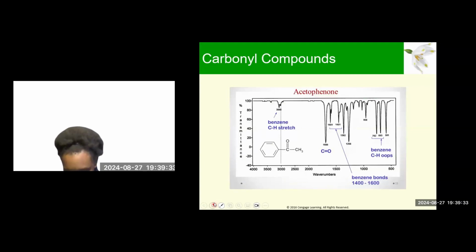So here, again, you see this carbonyl peak at around 1700. Now, because this is a benzene, you also have your aromatic rings there. Okay, and notice that you do not have any peaks here. Well, I'm actually too far down. Notice you don't have any peaks here, and so we know that it is not an aldehyde. Okay, and that's because you don't have that hydrogen group here. You have a carbon here, and that carbon is not going to give you those peaks.